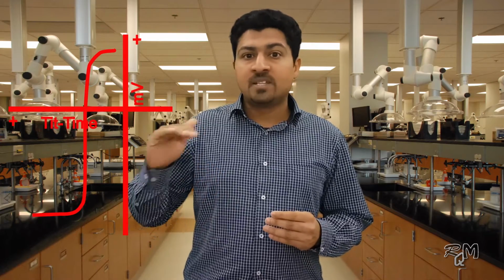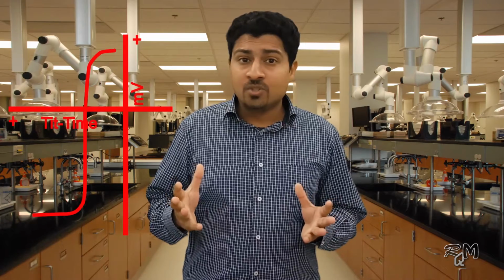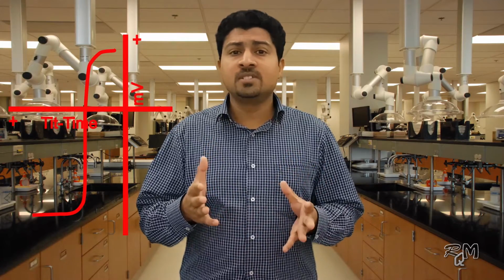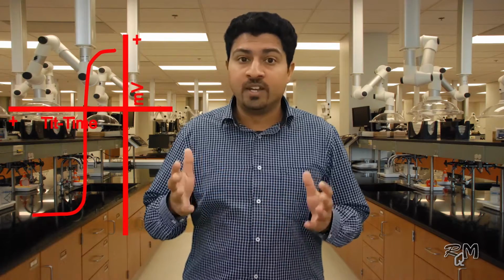Usually, after dosing conditioner, titration will start in between plus 10 millivolts to plus 50 millivolts. And as you know, we configured our application menu as 1 point descending potential. If you don't know about this, I recommend you watch the second part of this analyzer, where we did the basic configuration of this analyzer.